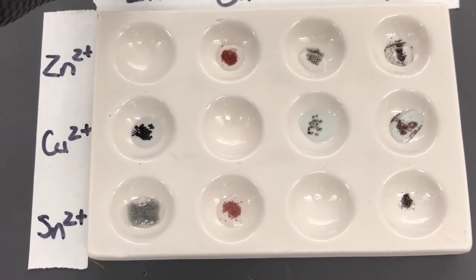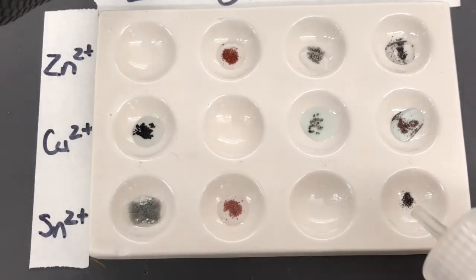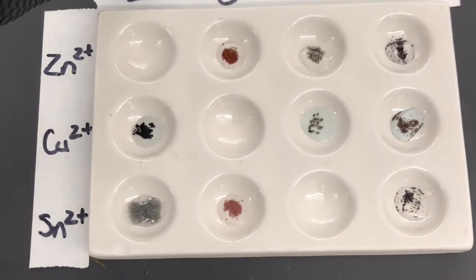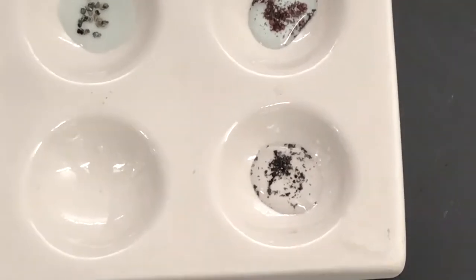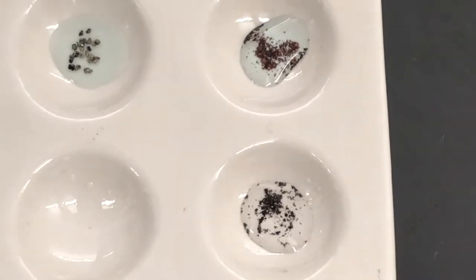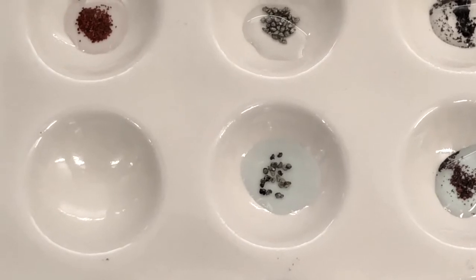Finally, we'll look at the iron, where we add tin 2 plus to it. When we add tin 2 plus to the iron, we'll look to see what's happening there. So in this case, we've got to look closely, and at first observation, it does not appear to have any reaction.